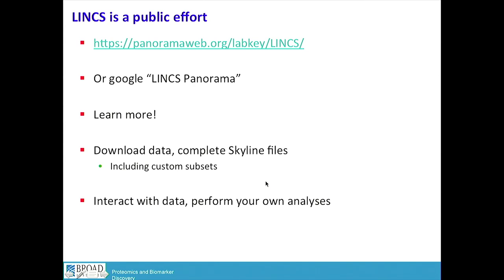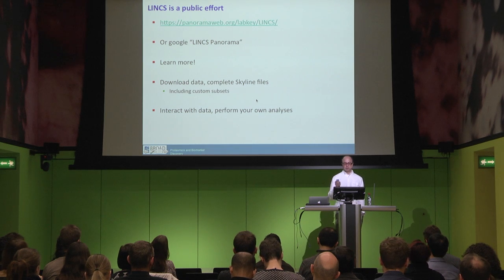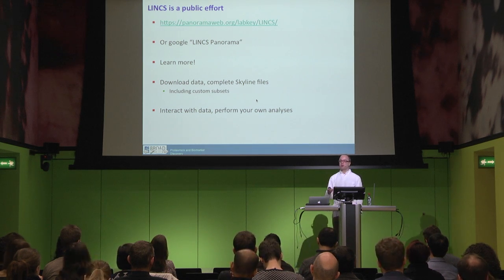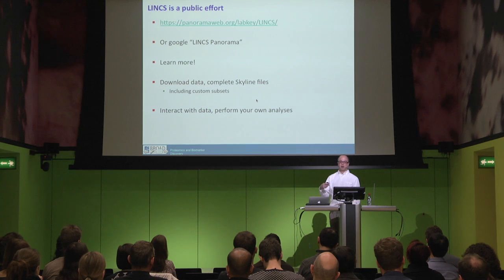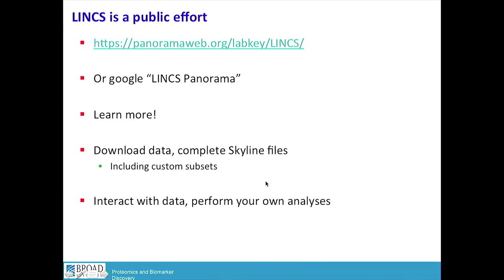There's some more about the background of the project, the drugs that we'll be profiling, and the genes that we'll be profiling. You can download all of these data, including the custom subsets that I showed you, and then you can interact with the data. There are links from our data sets that you can instantly get a heat map that you can interact with and cluster and do your own analysis or whatever you want.